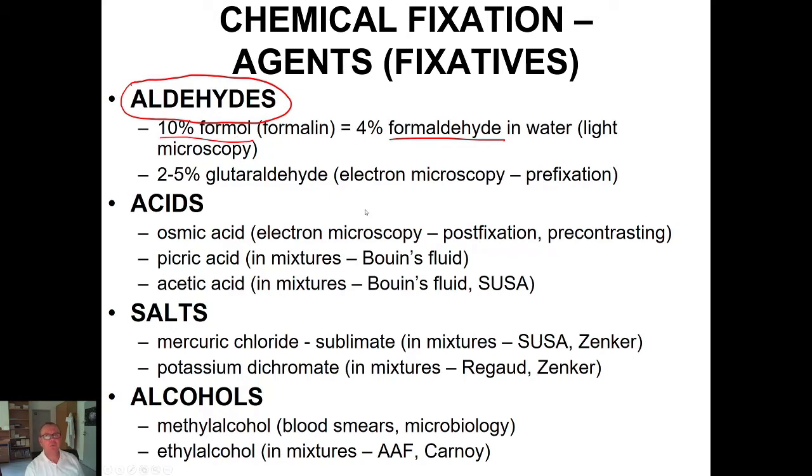Formaldehyde is used mostly for light microscopy, but in some mixtures also for electron microscopy.